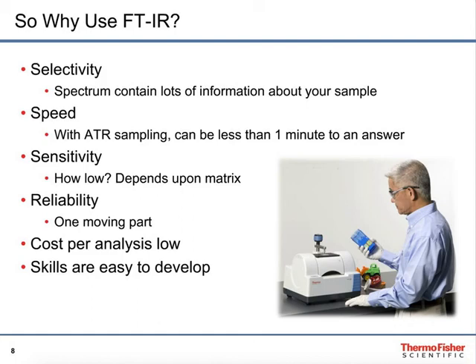The sensitivity, how low can you go? That depends very much upon what you're looking for and in what matrix it is. It's a very common question I get asked, and it really depends upon what you're looking for and what it's in. In one case, I was able to go down to parts per million. That was biodiesel in diesel fuel because there was a peak that stood out alone. Other cases are more complex.